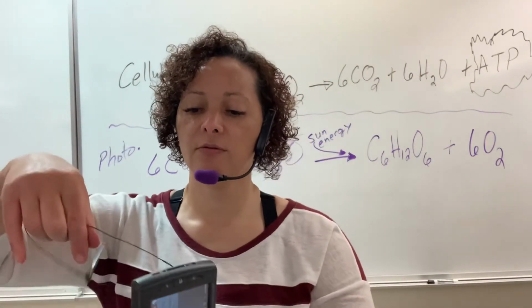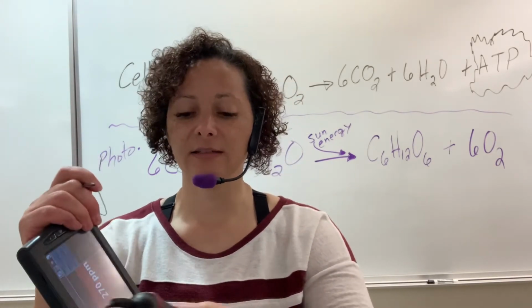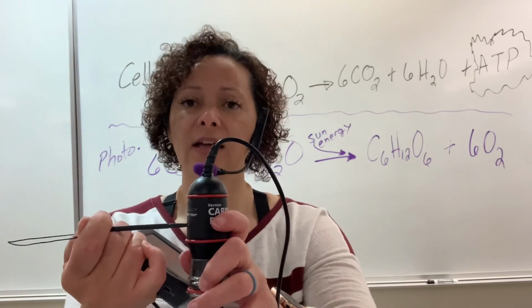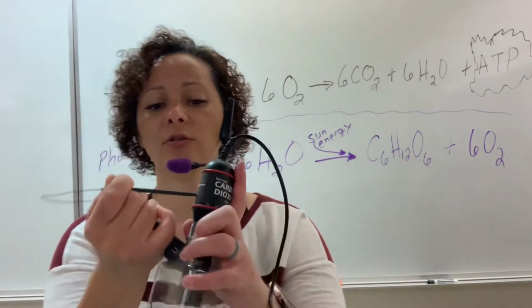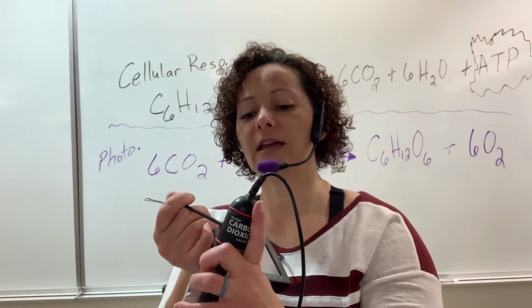Trying to show you everything all at once. Luckily, you have somebody else and you put your hand on the table. You're going to hold this in here and hold it until that red light on the side is going to stop blinking, and it's going to hold hard red. About 30 seconds. I have to look at it. There we go.